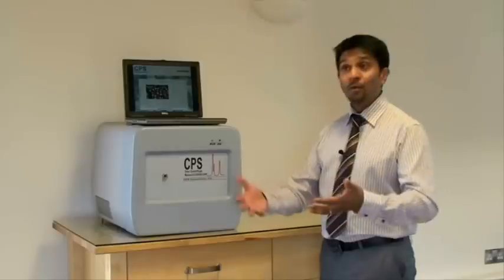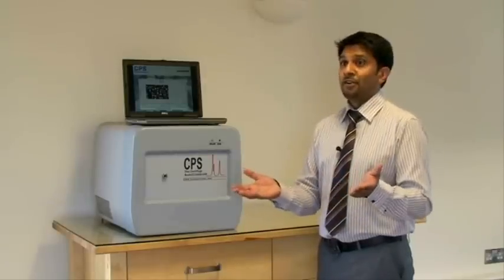Everyone would like to be able to image the particles and see what they can under a microscope, and we have a lot of evidence to show that the size distribution you get with the CPS instrumentation does match what you see under a microscope.